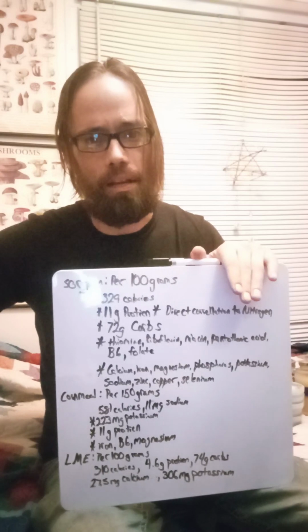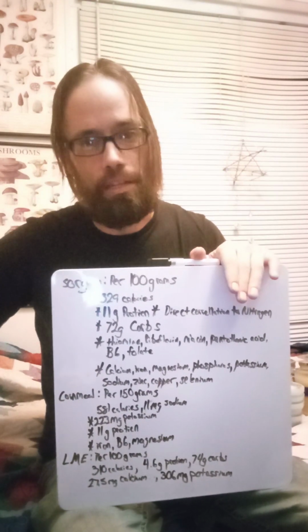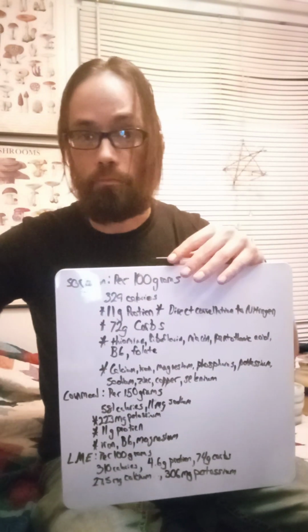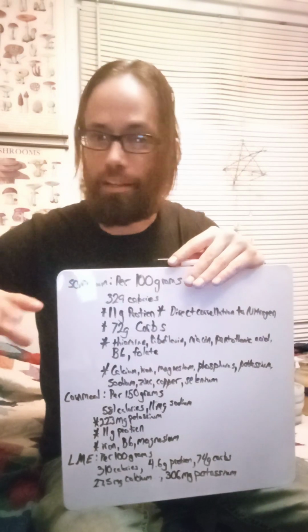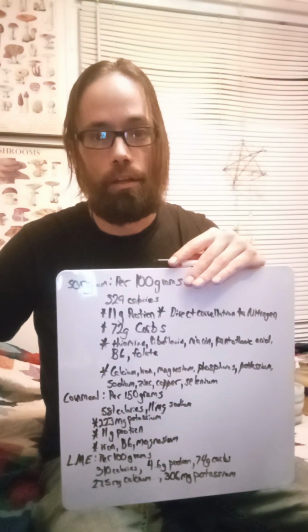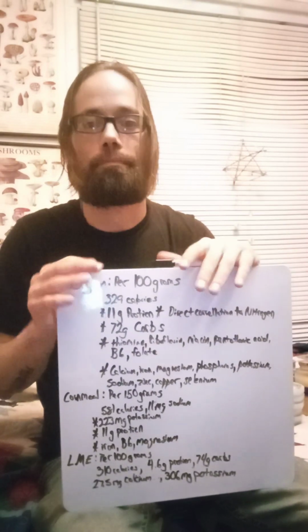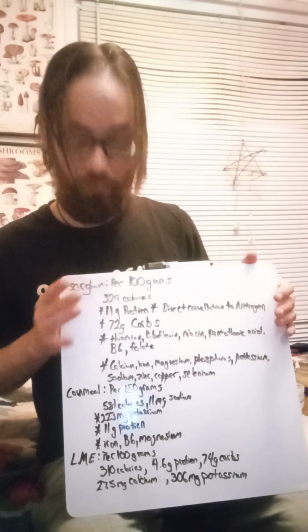I want this the same every time, and I don't want to have 23 plates of one thing and then 17. I want 20, 20, 20, 20, 20. Even if I'm pouring all the same media that day, I want 20 plates from each bottle, and I'm throwing the rest out. I'm like that. Do I need to be? No, not at all. Anyways, moving on. The sorghum.